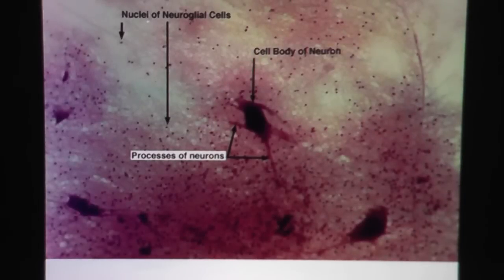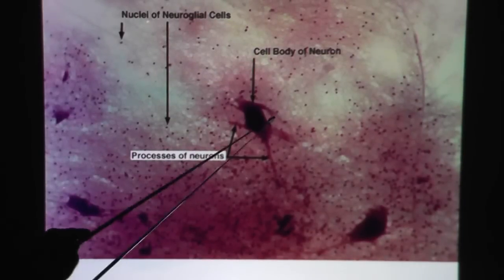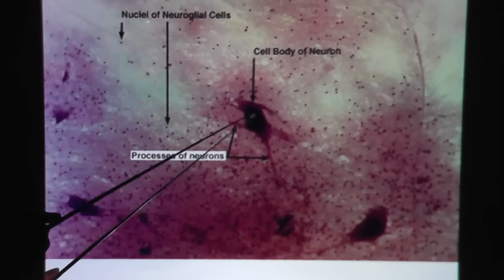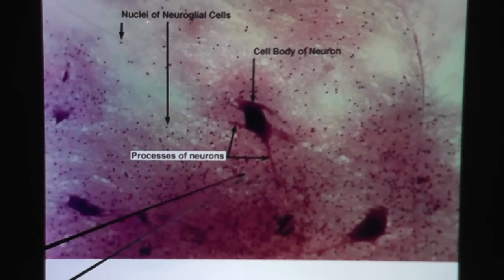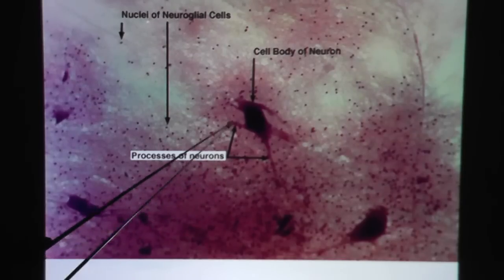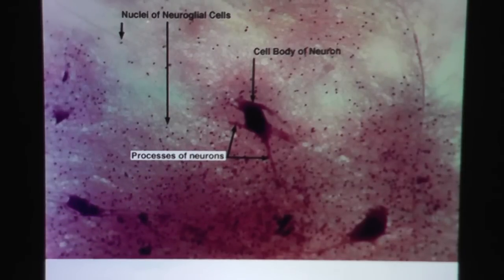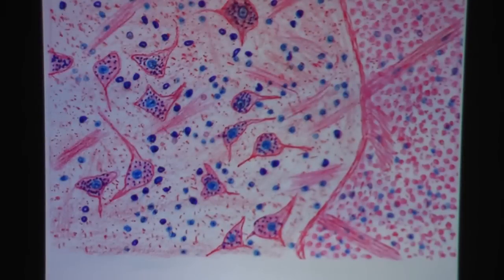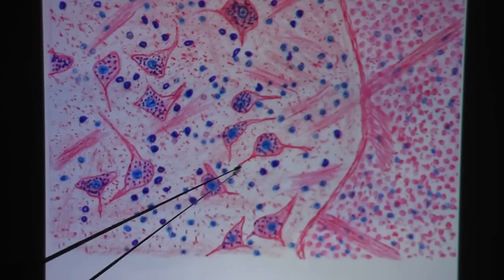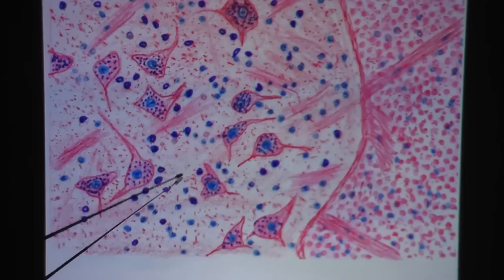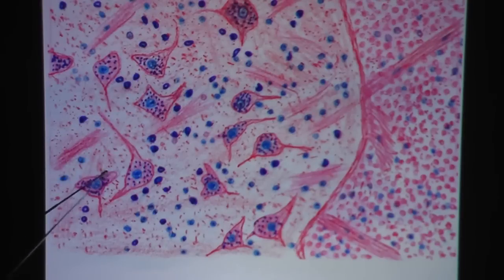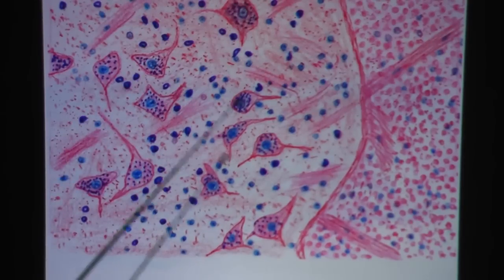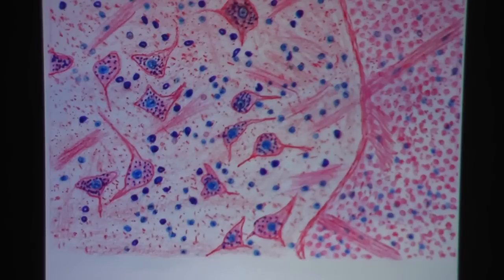Here's another look. Here we see several neurons — it's hard to see the nucleus, but you can see the nucleus of the glial cells and you can definitely see the processes of these neurons. Here's a drawing showing the neurons and the glial cells' nuclei. Notice some of the processes from these neurons — one would be more prominent and longer, which would be the axon, while everything else would be shorter and would be the dendrites.